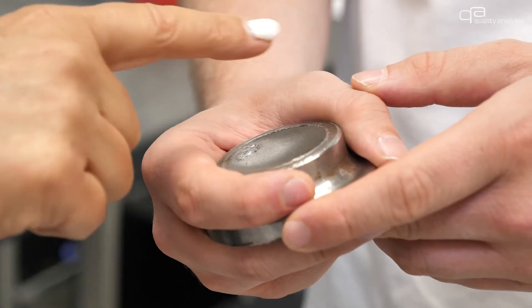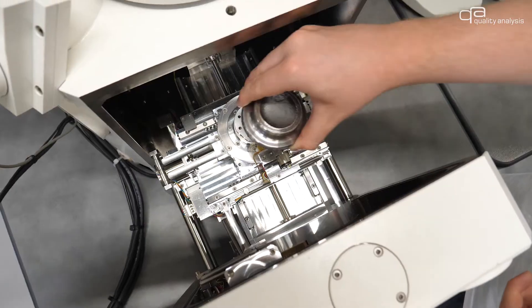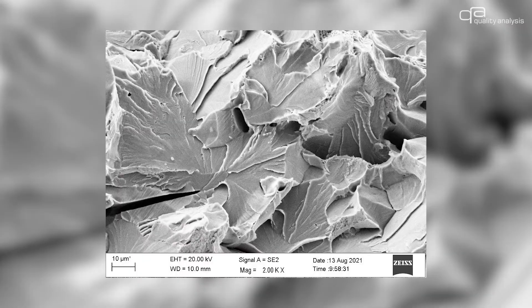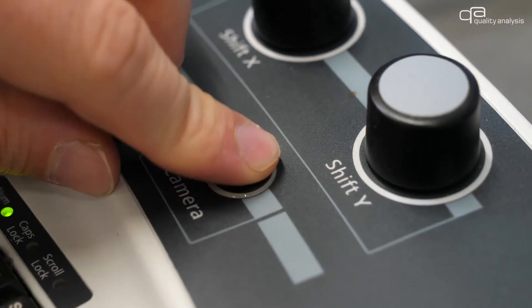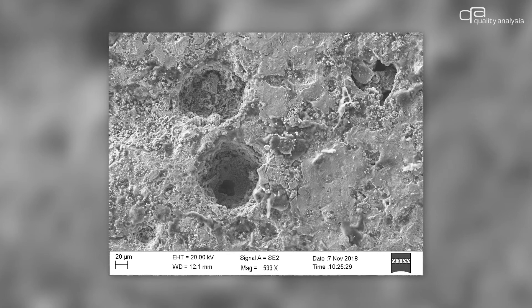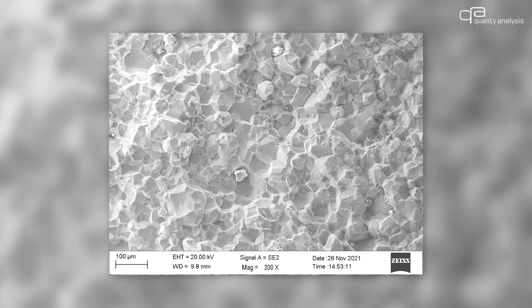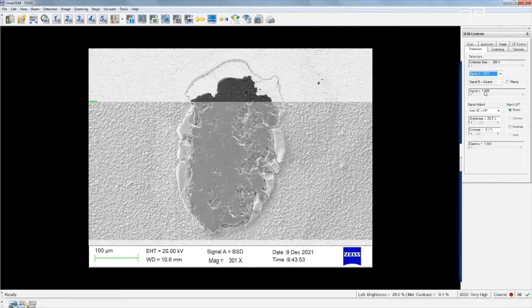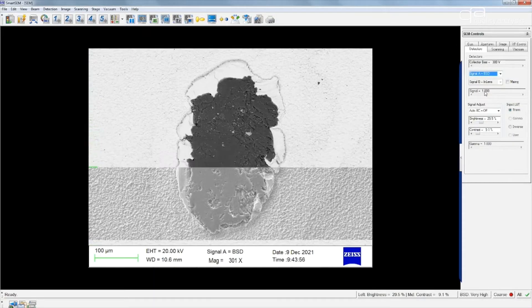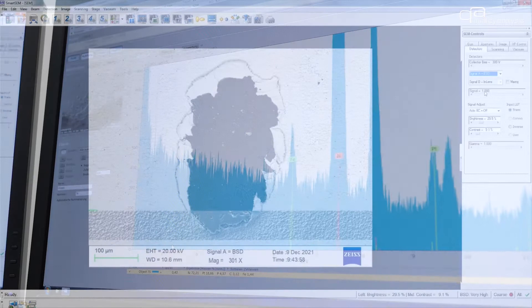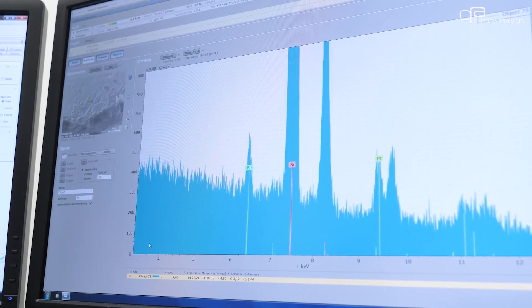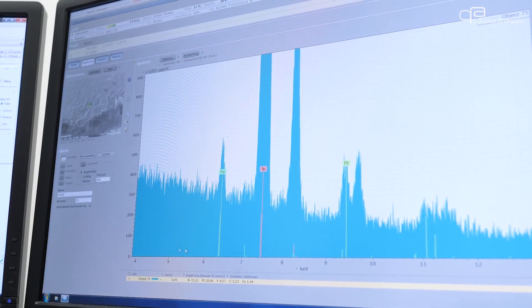SEM analysis focuses on the following areas in particular: the classical assessment of fracture surfaces in damage analysis, the identification of microstructural constituents, investigations in tribological systems, the analysis of coating systems, and the detection of corrosion processes, to name just one sub-area. Different detectors allow an individual collection of information. The EDX analysis additionally provides information about the elemental composition.